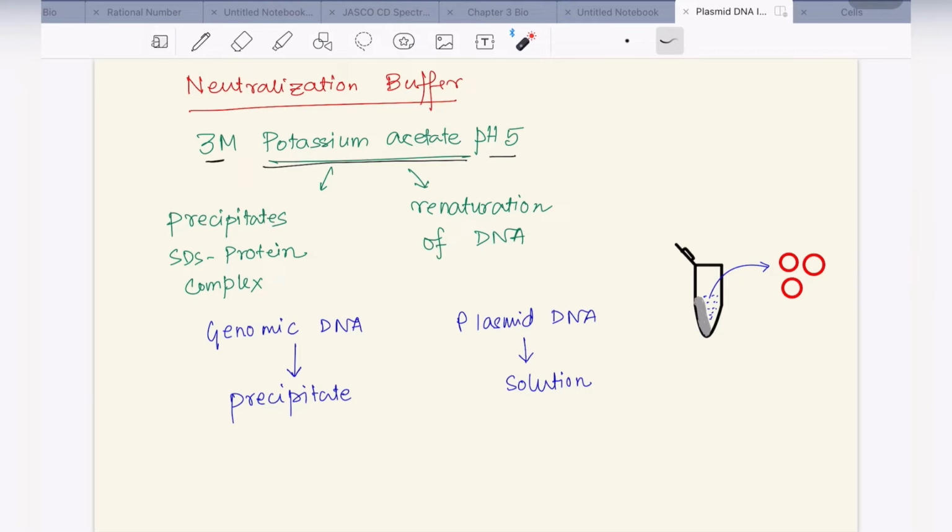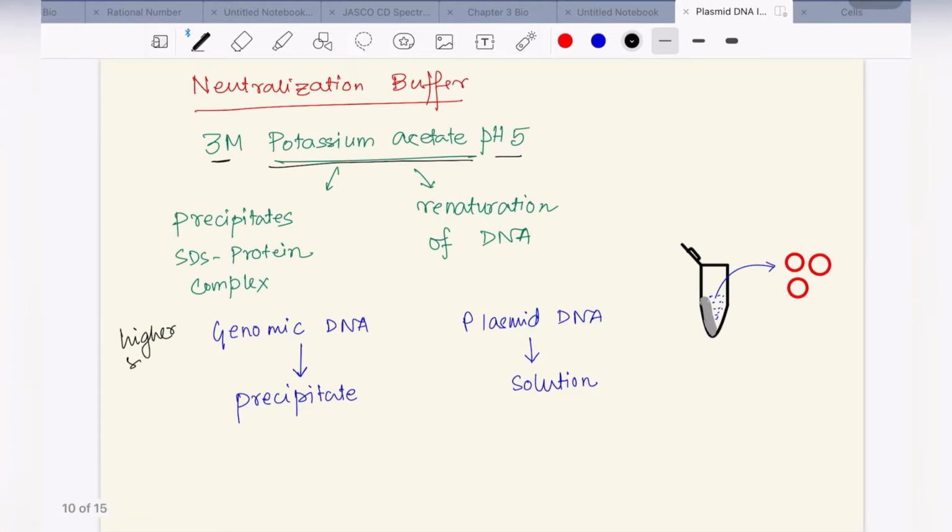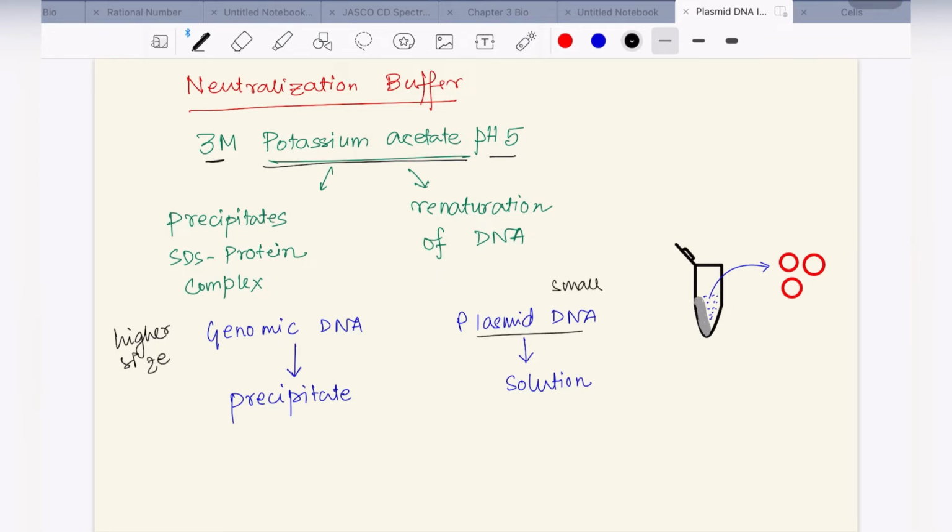The role of potassium acetate is that it renatures the DNA. Now, when this renaturation takes place, we should remember that the genomic DNA is much higher in size, that is, higher in molecular weight, than the plasmid DNA, because plasmid DNA is a very small DNA molecule, right? Because of that, the renaturation of the genomic DNA will be much more difficult, because of which genomic DNA will not be able to fully renature, and it will come in the precipitate. However, plasmid DNA, which is a very small DNA molecule, will stay in the solution. So that will actually help us to isolate the plasmid DNA from the genomic DNA.